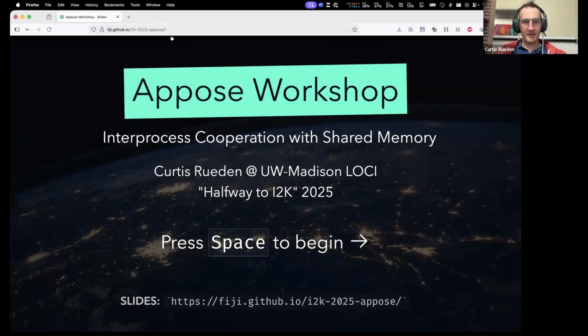If you want to follow along with my slides, you can find them online here. I'm going to refresh my slides just in case, because I pushed something not that long ago. The only prerequisite for this workshop is that you have Fiji downloaded and installed and updated. If you don't have that, please feel free to do that. And if you don't do that, that's okay. I will still be walking through everything and you can just watch. So no pressure, no worries.